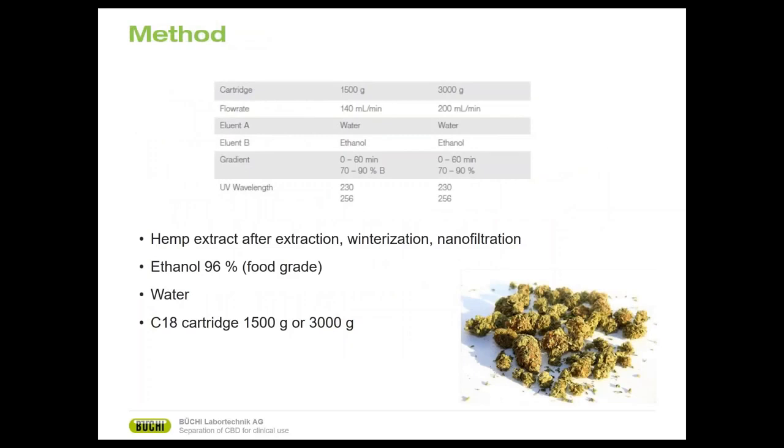So let's take a look at the method. Those are the starting recommended conditions for cannabis applications for 1.5 and 3 kilo cartridges. Ethanol and water are used as the mobile phase. You see the difference at this point, the only difference is the flow rate of the two cartridges, because once you have the cartridges, the amount of back pressure you will get from each cartridge is different.